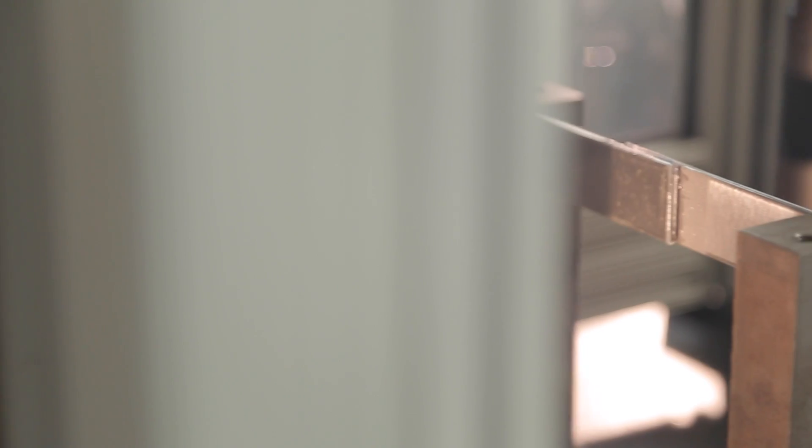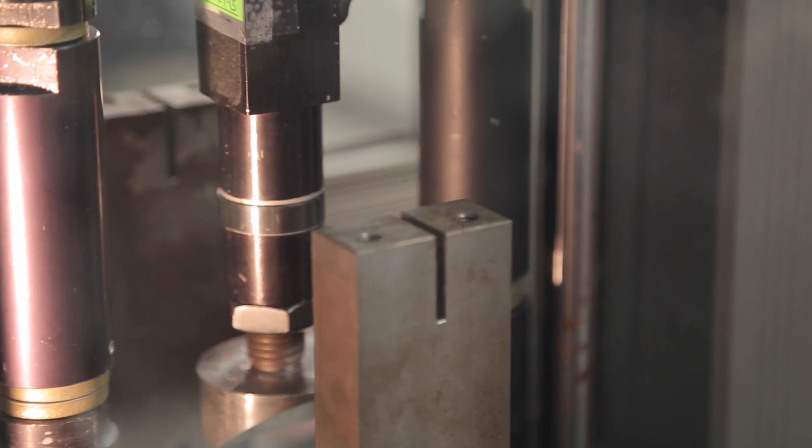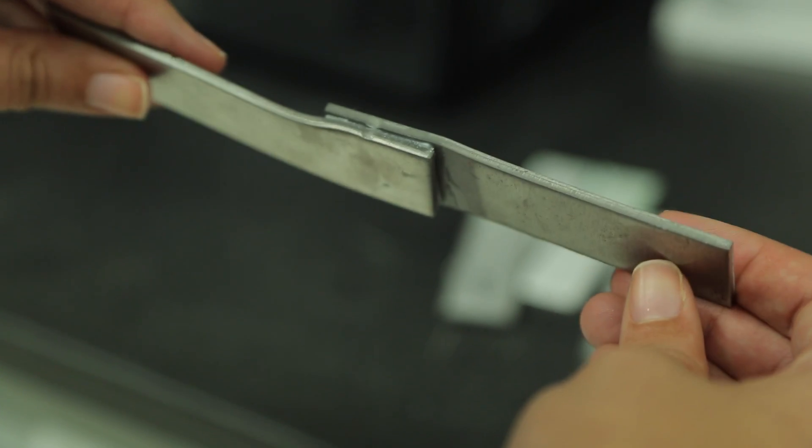One way to test for impact resistance is to drop a weight from a set height onto a bonded assembly and then record the absorbed energy. Did you know that nowadays adhesives which in the past had low peel and impact strengths can be toughened with elastomers, resulting in substantial improvement to these properties?